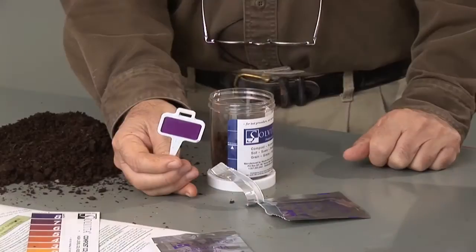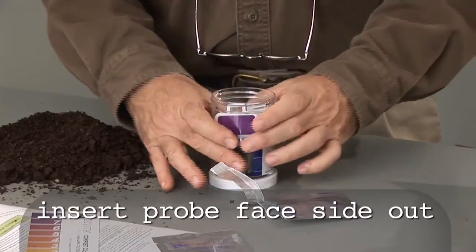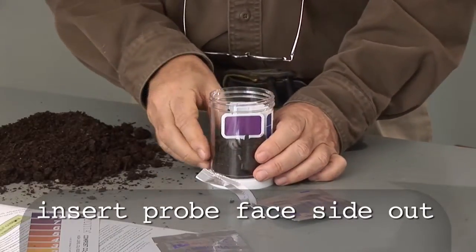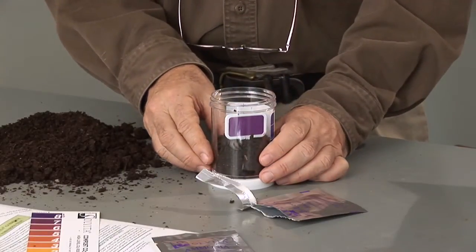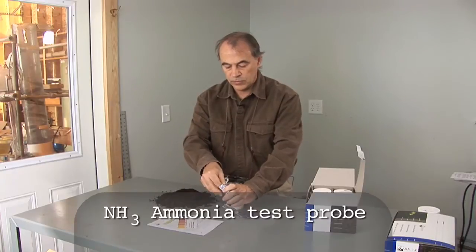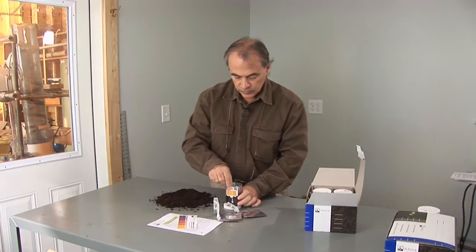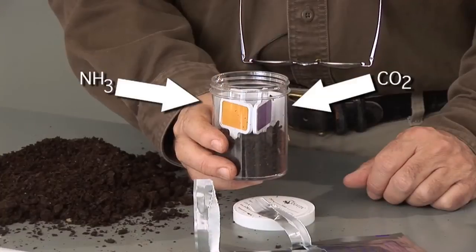Now we're going to insert the probe into the sample so that you can see it through the outside of the jar. We are going to immediately open the next package, which is the ammonia test, and insert that paddle in a similar way into the sample. You can see both paddles now through the outside of the jar.